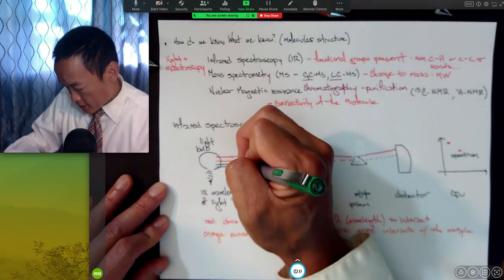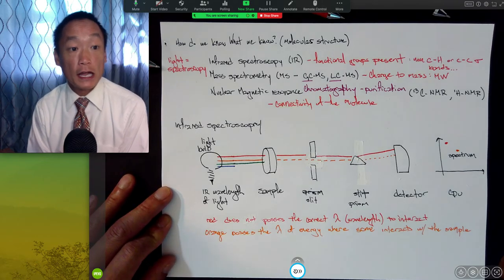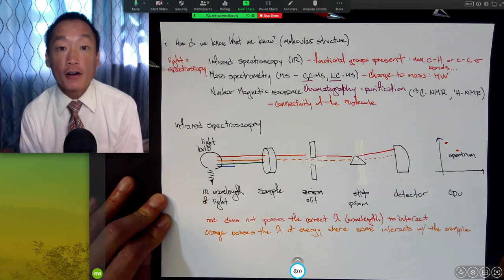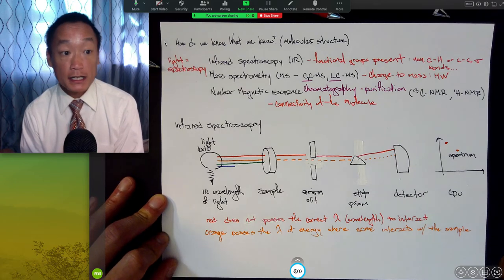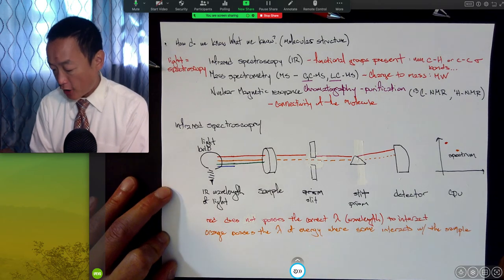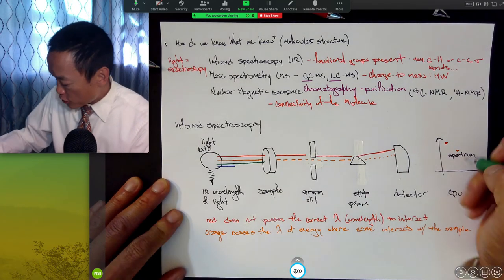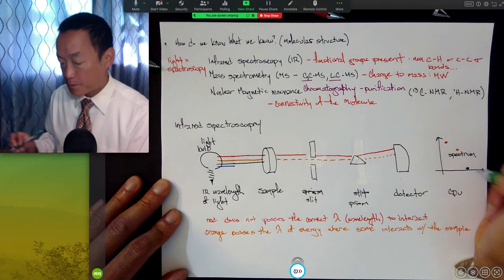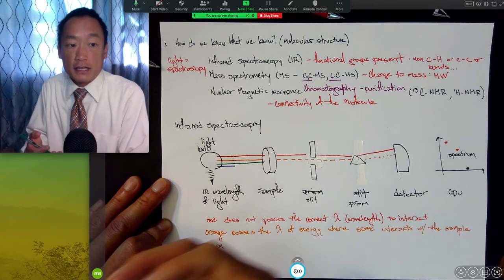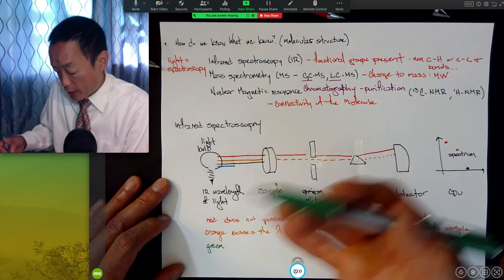Look at this. That green wavelength of light hits that sample, and all of that energy is absorbed by the molecule. All of that energy is translated into some molecular motion inside that molecule, and all of a sudden none of the light makes it back through, and that means that it's going to appear somewhere else in the spectrum. Okay, so green wavelength, and again, it's not color, but you get the idea. Different colors are different wavelengths, and so different wavelengths here are represented in the IR range by different colors.